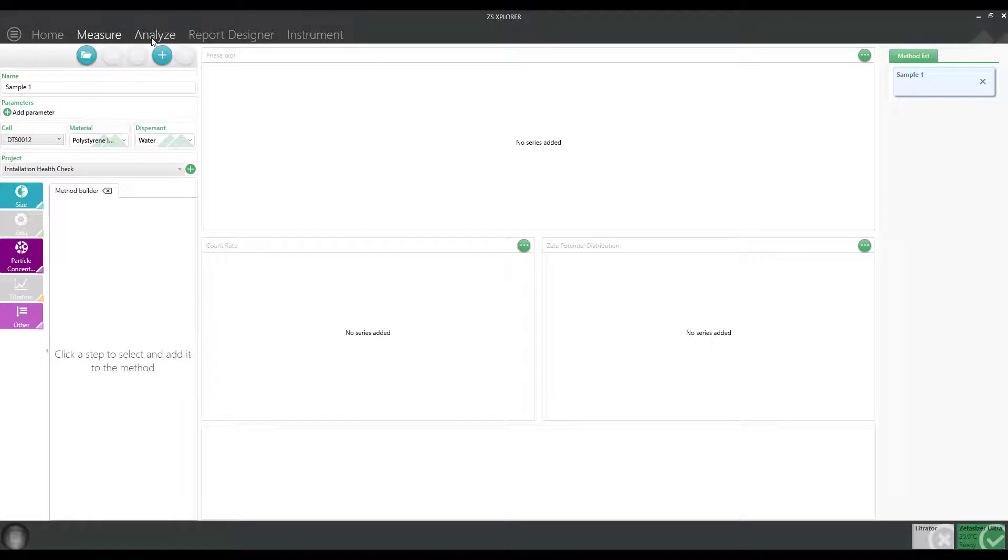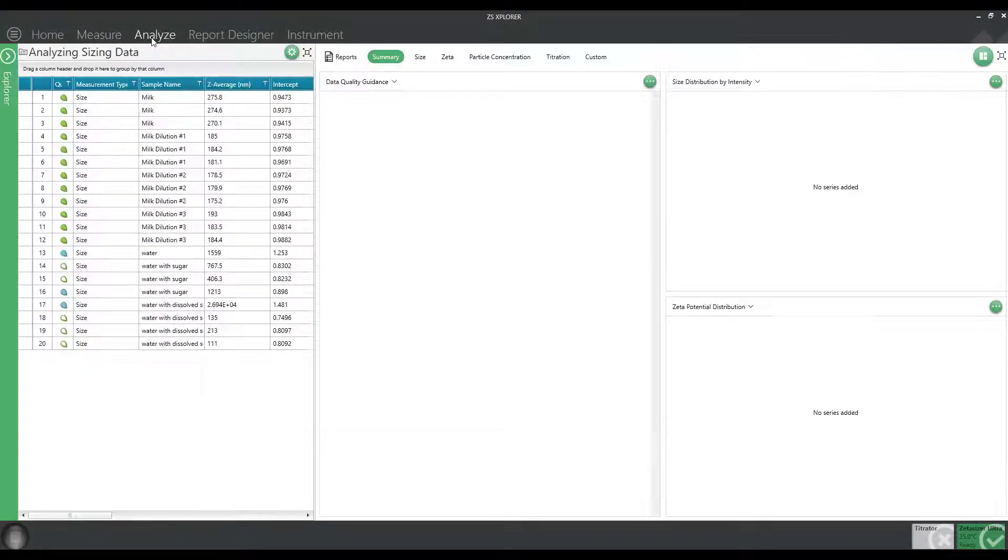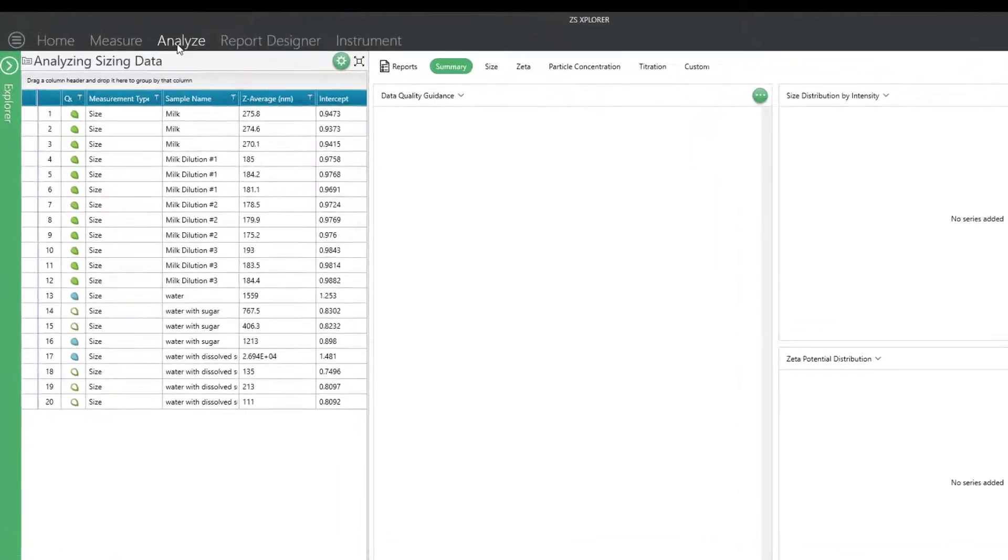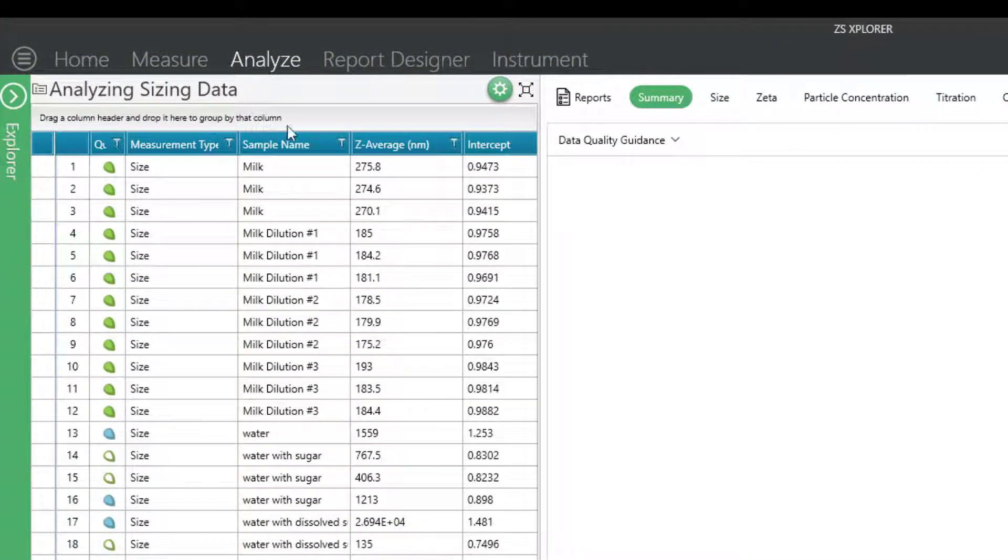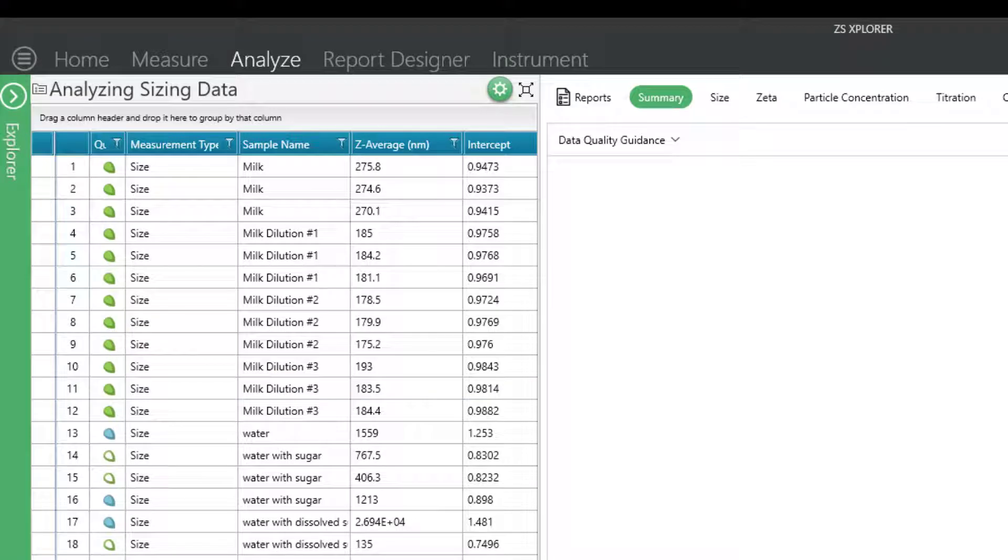Let's talk a little bit about analyzing your sizing results and how to determine if your data is valid. If you navigate to the Analyze page, you can see some of the sizing results that I've displayed here on some real samples.